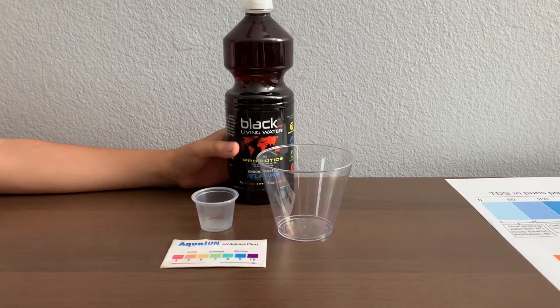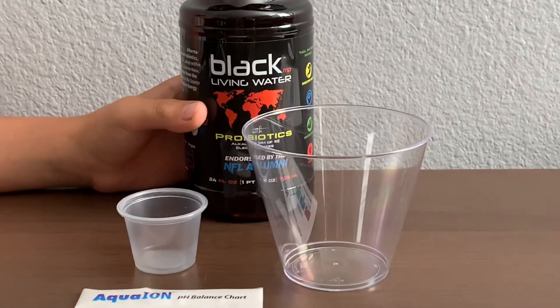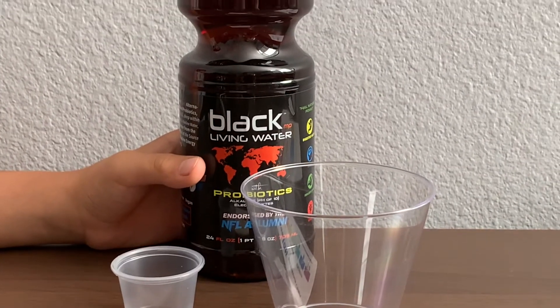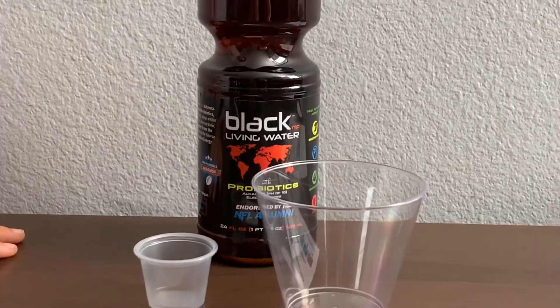This is black living alkaline water infused with soil-based probiotics, fulvic and humic acid. The pH is supposed to be 10+, sold at Lucky Market in San Francisco for $3.99. Let's test the pH and TDS levels.